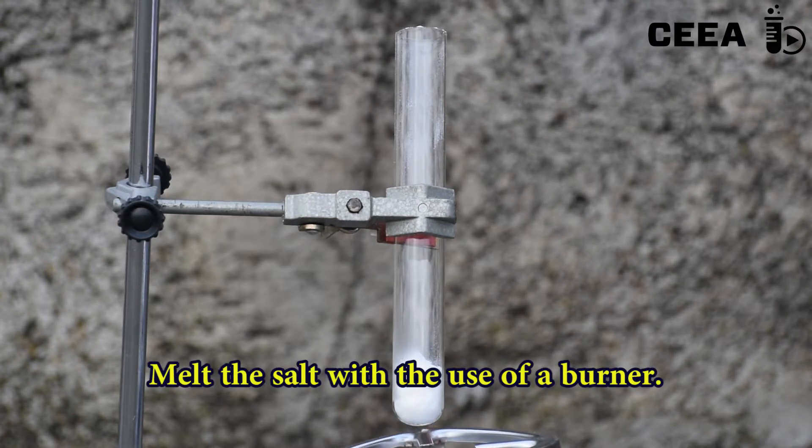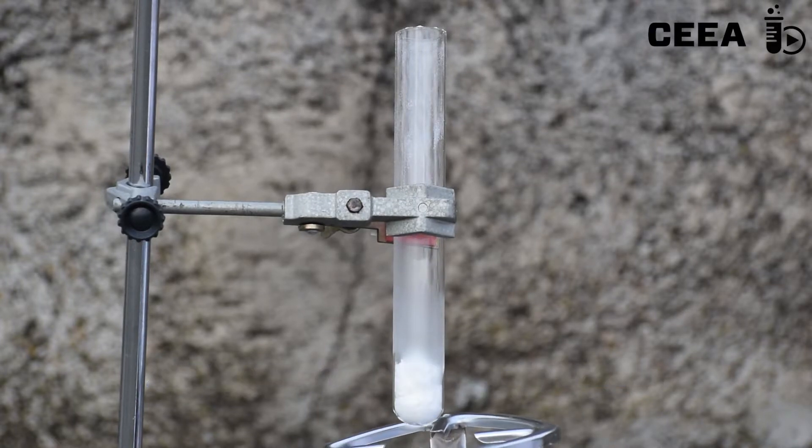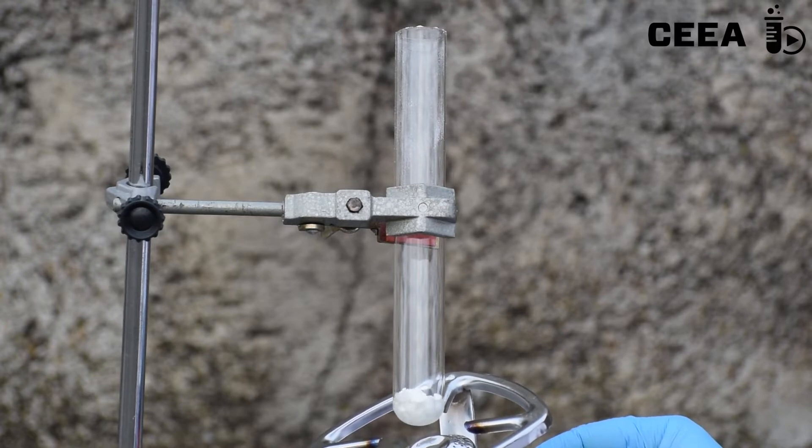Melt the salt using a gas burner. You will get a clear, colorless liquid.